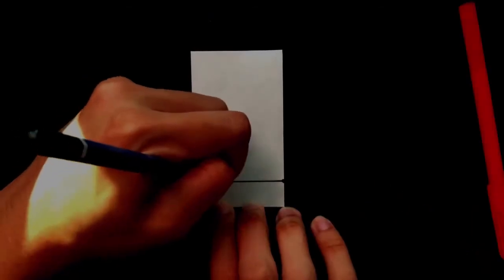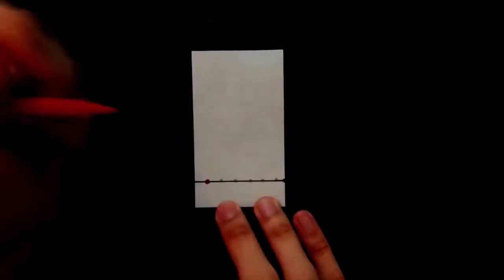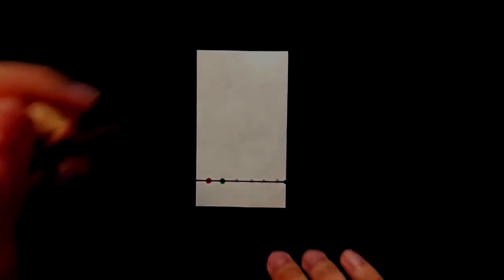Now let us repeat the experiment, but this time let's draw the start line with ink rather than pencil. We'll again repeat the same steps.